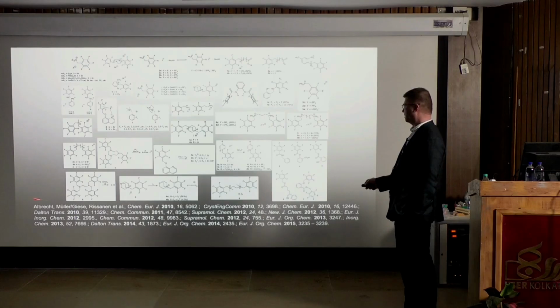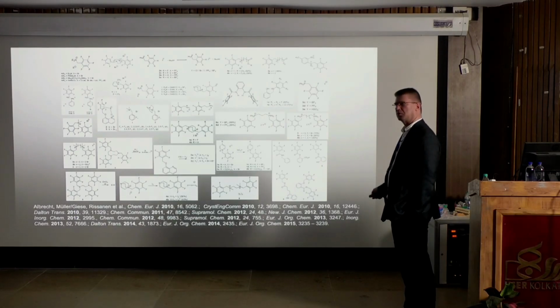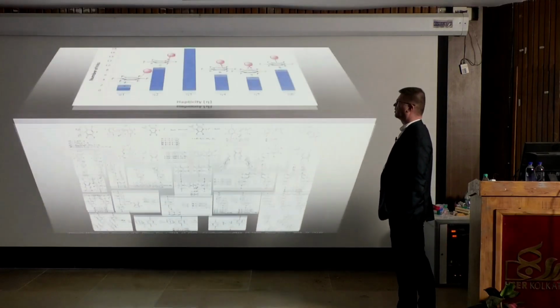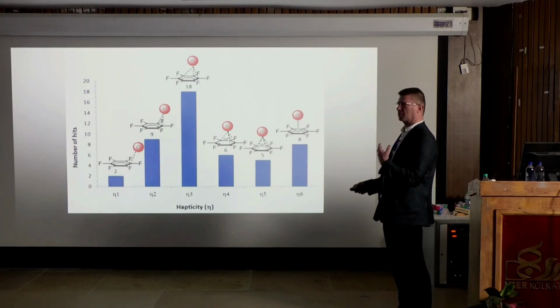And we published this pile of papers on these. All in all, there were more than 110 X-ray structures. Of course, you can't see all of them in various levels, looking for this kind of thing. And we did an analysis of which kinds of things we can see.